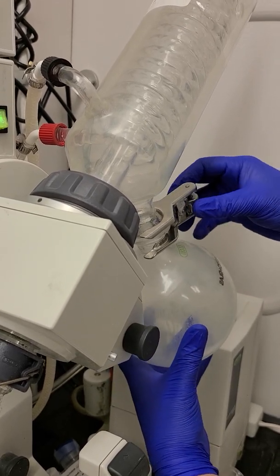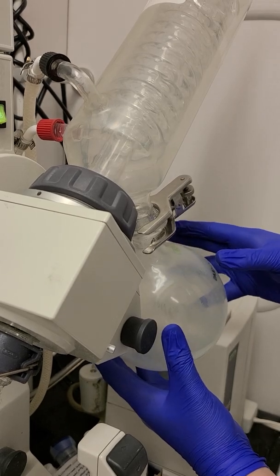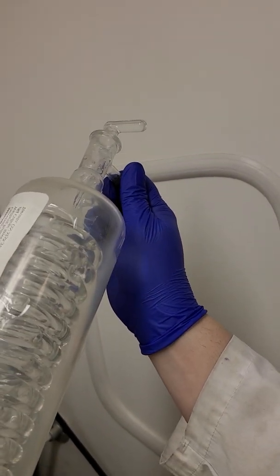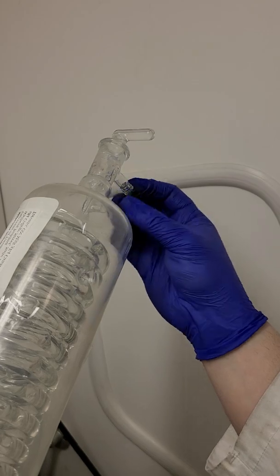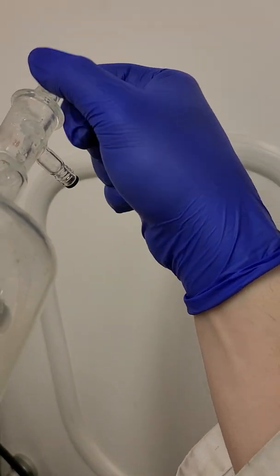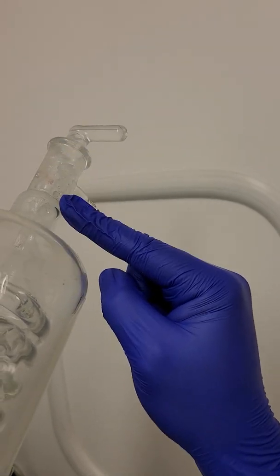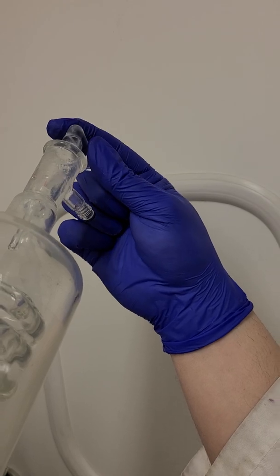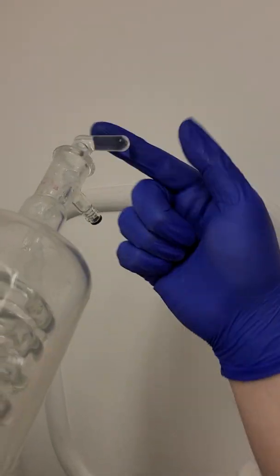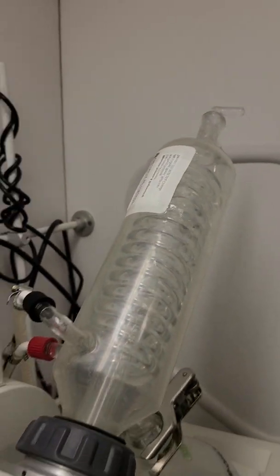It rotates because it's a ball joint. So we just gotta make sure that it's secure. Okay, so that's good. This up top is a release valve. So you can unscrew it. And as you can see, there's a little hole on the inside of this. This has to be greased so that it can rotate. Essentially what this does is it can slowly release the vacuum by lining up that hole with this outlet. Just make sure that this hole is no longer in line with this when the vacuum is on.